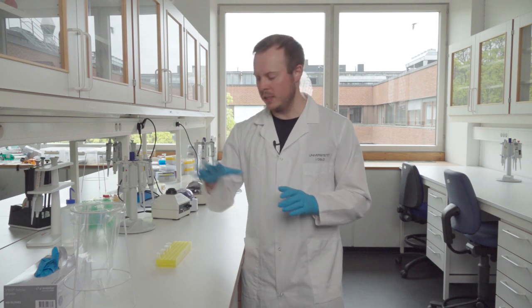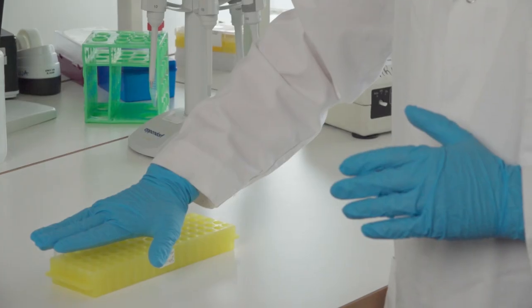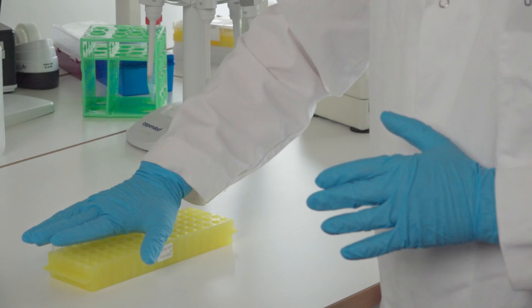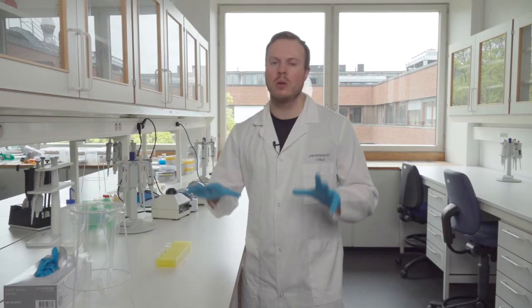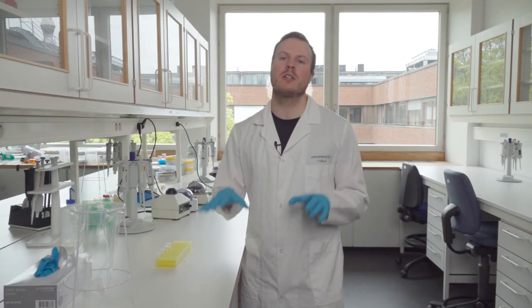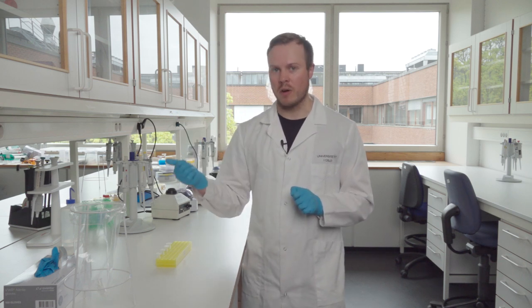But the important thing here is that these samples now contain high amounts of PCR products and they should only be in the post-PCR lab, not go to the pre-PCR lab.